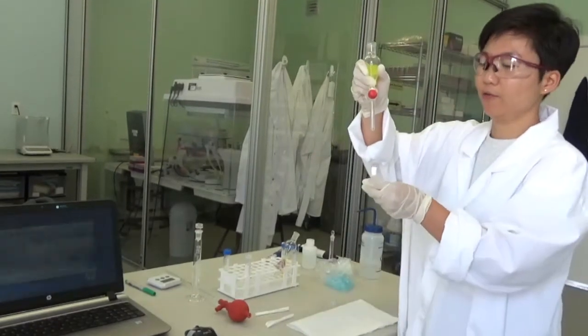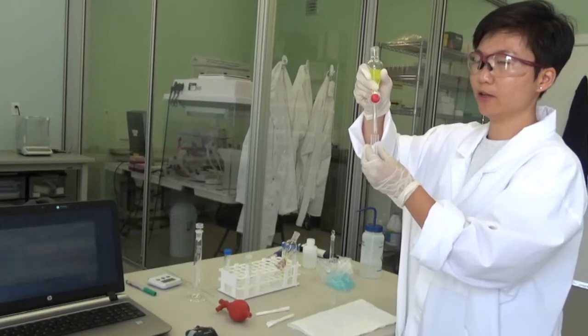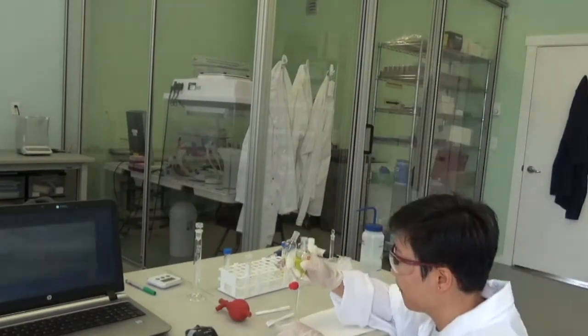Then next you can fill up the quartz cuvette with the organic layer solution.